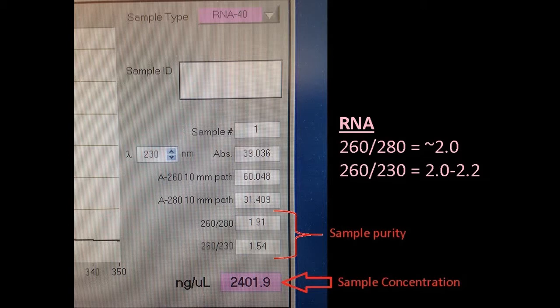However, the 260 to 230 value is a little lower than the acceptable range, which is likely due to phenol, since my RNA extraction was based on a phase separation method using that reagent.